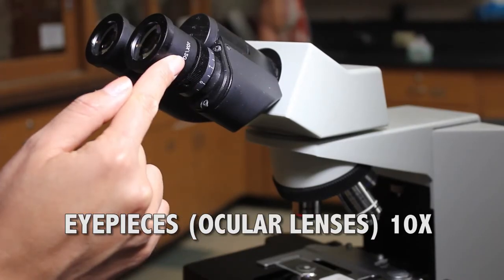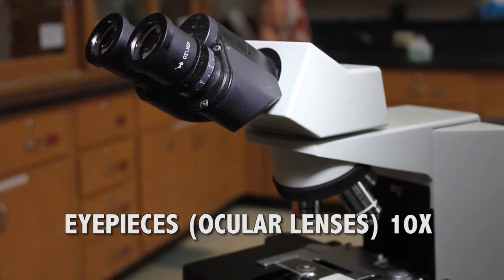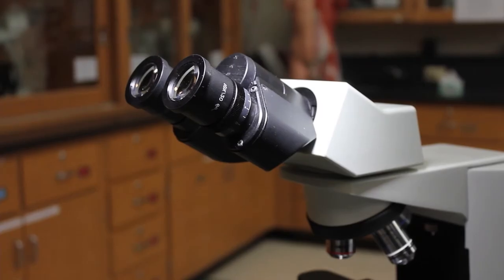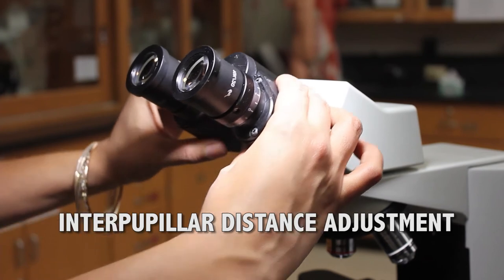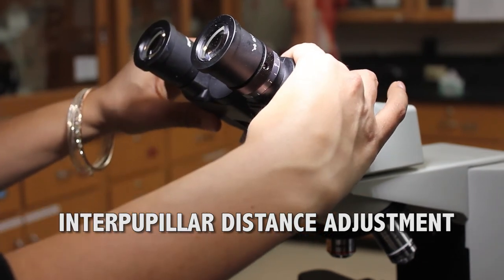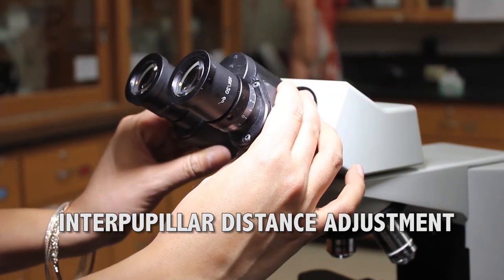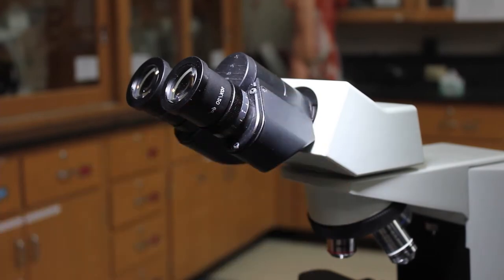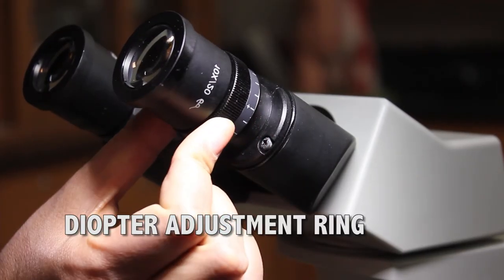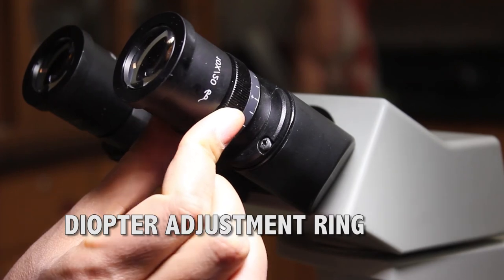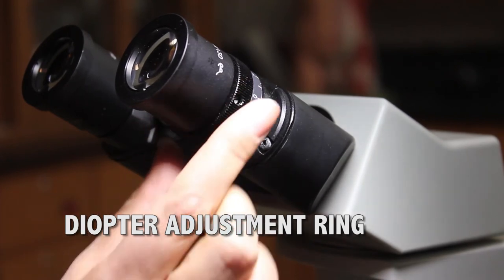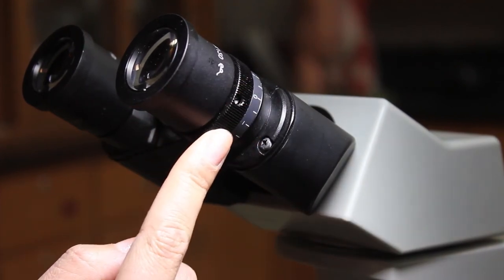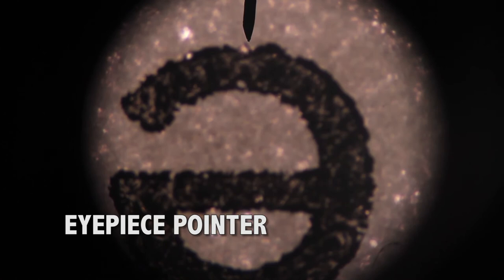Eyepiece or ocular lenses are 10x magnification. Interpupillary distance adjustment adjusts the distances between the two ocular lenses. Diopter adjustment ring will compensate for differences between the eye focal lengths. One of the eyepieces has a pointer.